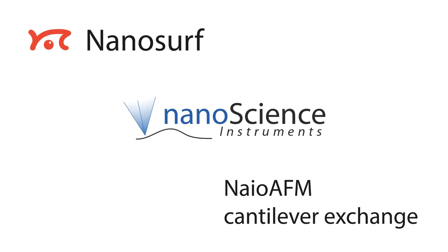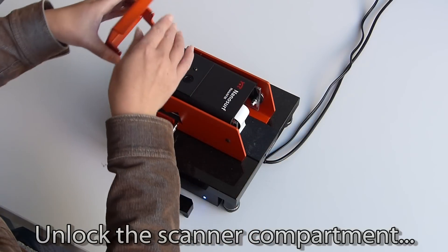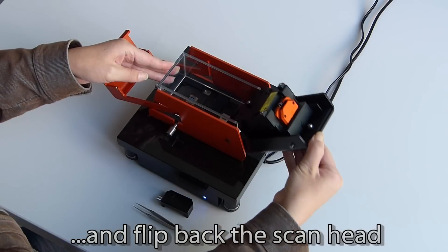We would now like to show you how the cantilever is exchanged in the NIO AFM system. We open the system exactly like when replacing the sample. We flip back the locking cover and pivot the scanner.